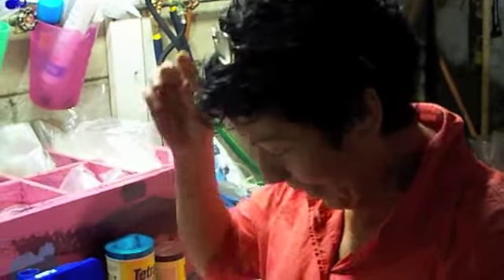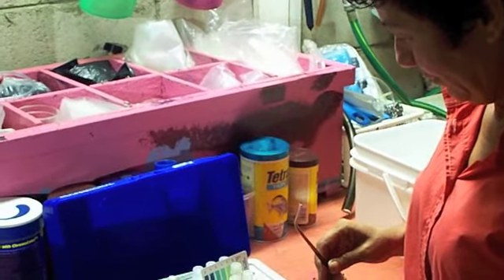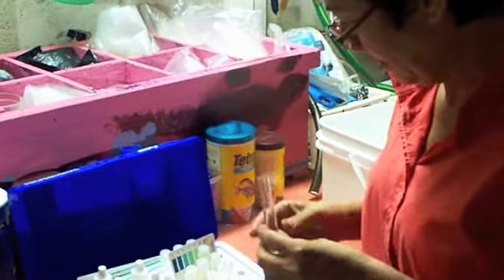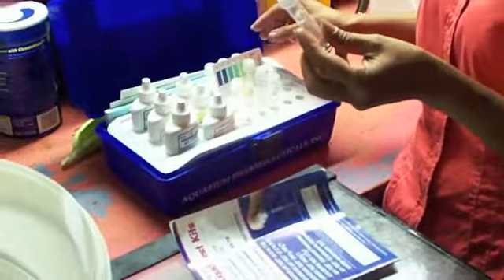Okay. Basically, the reason why we open this blue box is for one reason and one reason only. See one of those glass vials? I guess this one? Get one with a lid. Okay, that's all you need out of that box, so you can put the book back in and close it up.